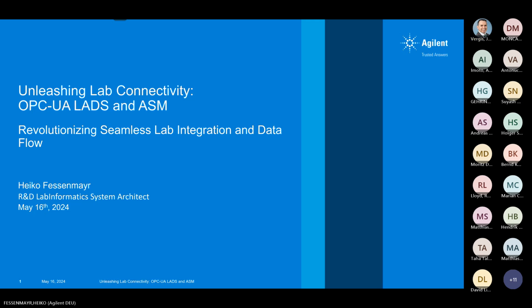So I wanted to talk a little bit about the ASM and that combination with OPC-UA LADS. As you know, there has been some activity in recent years to not only have standardization in the data formats part, but also on the instrument automation part. And there are actually two activities ongoing. The OPC-UA LADS standard was released at the end of last year, and we are currently working on another OPC-UA standard called KAISI, where major analytical vendors, Agilent, Thermo, Shimadzu, and Waters are working together on an OPC-UA based device driver concept to be able to exchange drivers more easily.